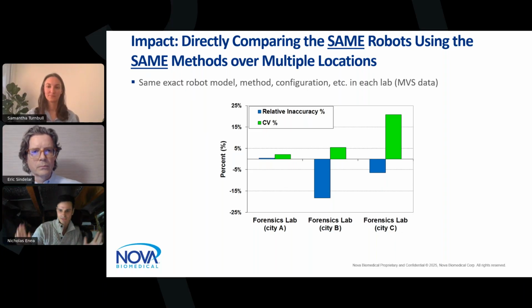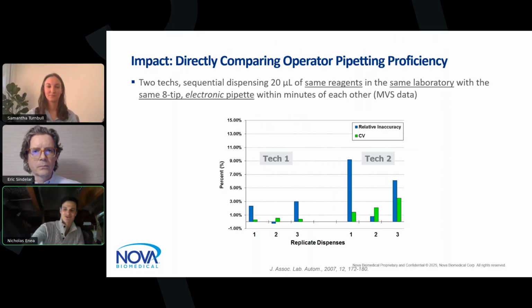So at a really high level, that's another way to look at it. Even from a manual pipetting perspective, because most manual processes, especially with scale, will be transferred over to some type of automated process, we need to make sure the techs are optimized as well. I joke, there's liquid class optimization and there's people optimization also.